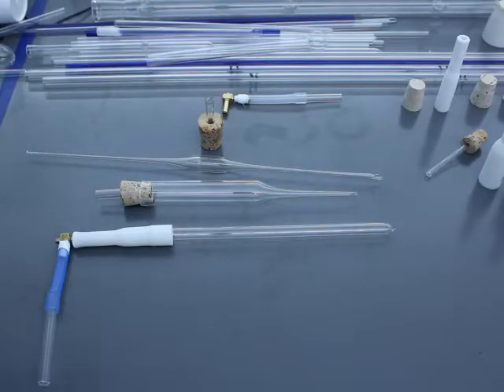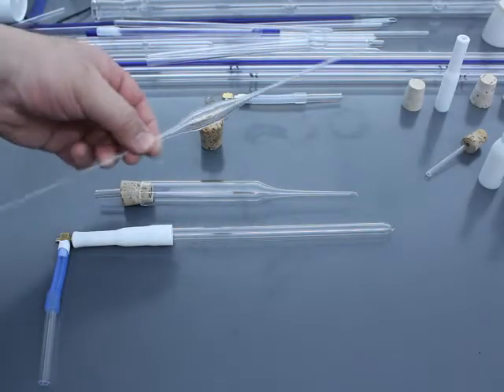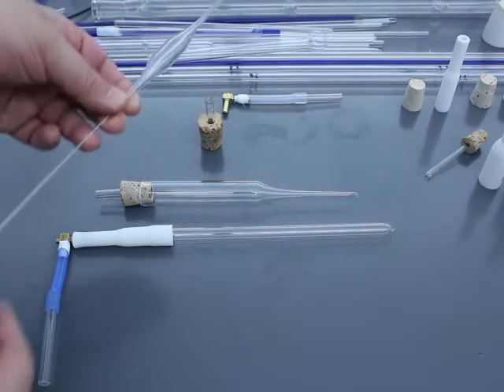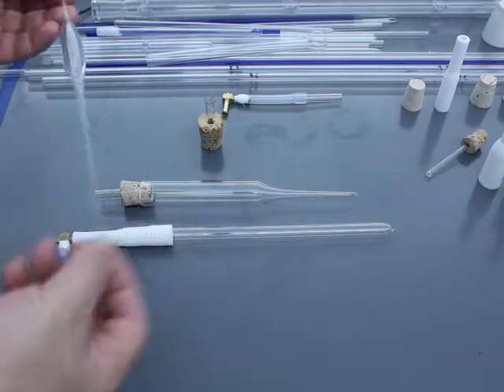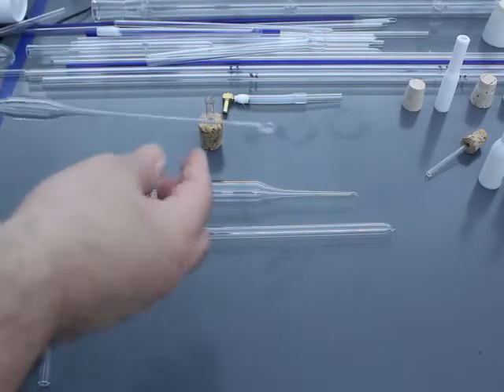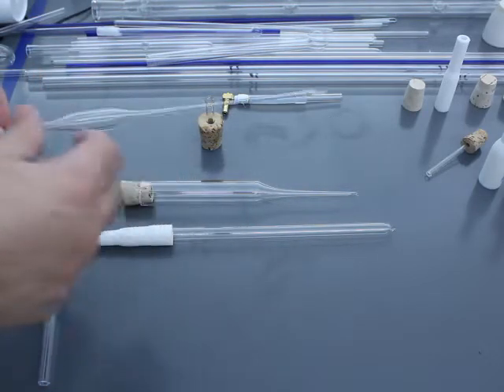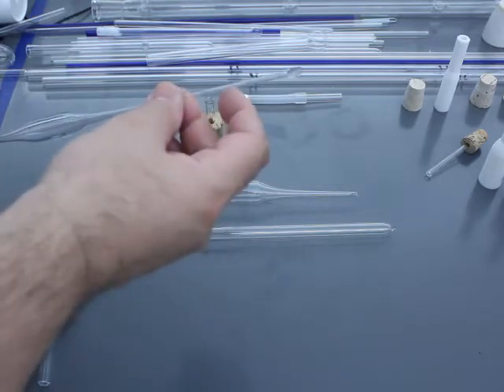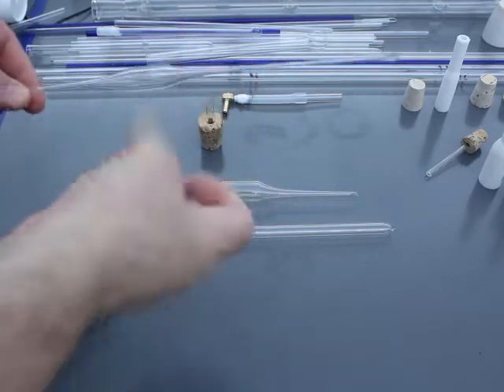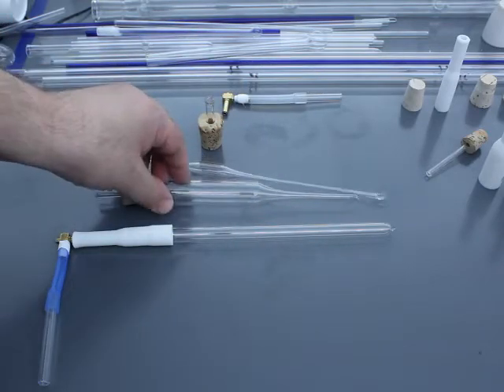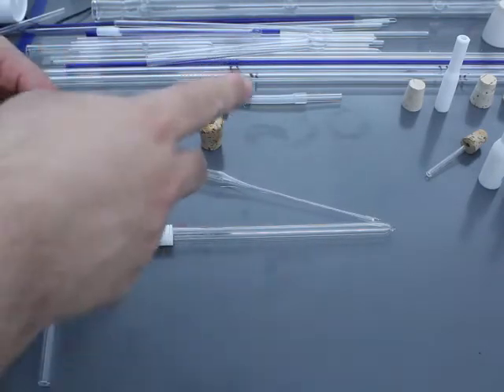And for comparison, this is a point. Actually, one of my students pulled this point last year. It's actually closed at both ends, so you would cut one of the ends, fire polish it, heat up this segment of glass, and then blow in to the open side while holding the other side.